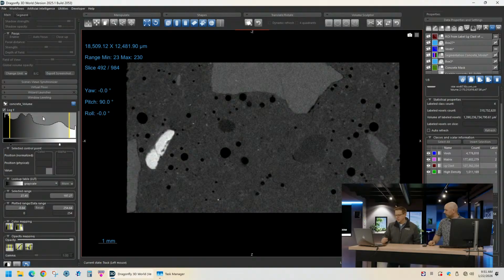All right, Stephanie: I work in pharmaceutical development. What type of segmenting would you recommend? So we talked about many different types. We had the histogram segmenting, then the painting tools, and then the AI. If you're in pharmaceutical, is there a silver bullet here? No, there's not. I guess the nice thing is you have options. You have a ton of options.